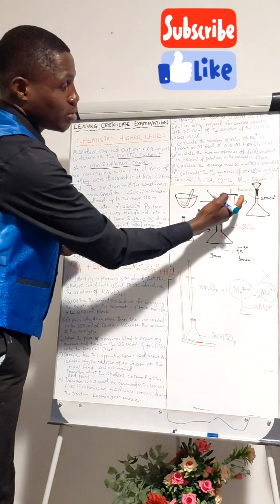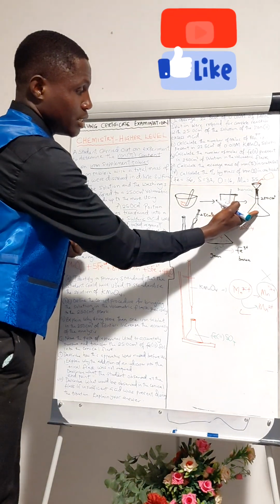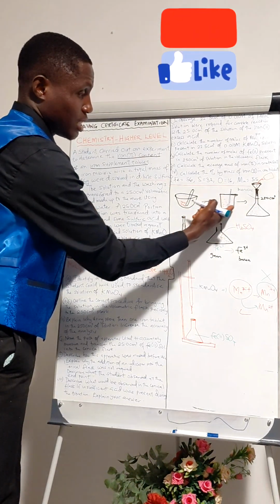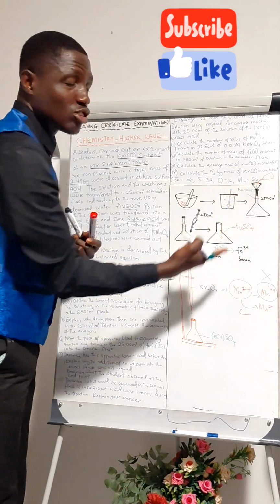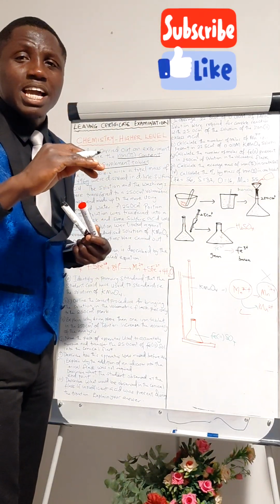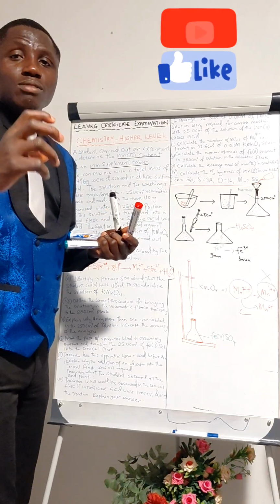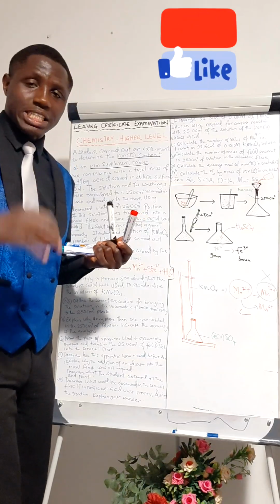The water you add to the solution of tablets in sulfuric acid must be added in such a way that it does not pass the meniscus level. In order to prevent excess, you use the deionized water from the wash bottle, as it enables you to add the water drop by drop.